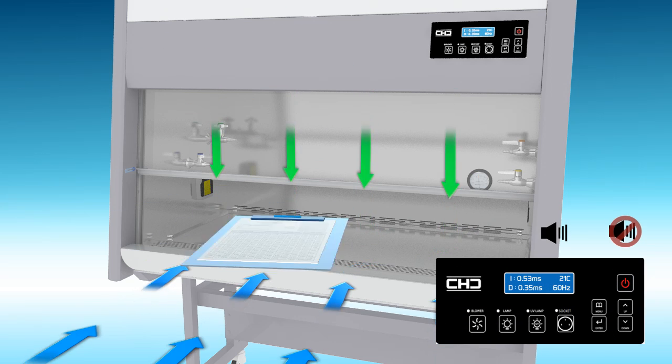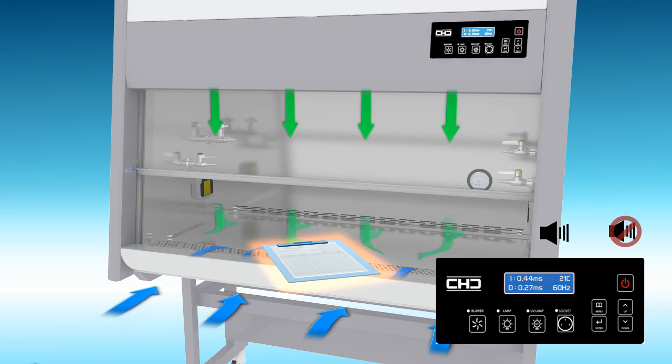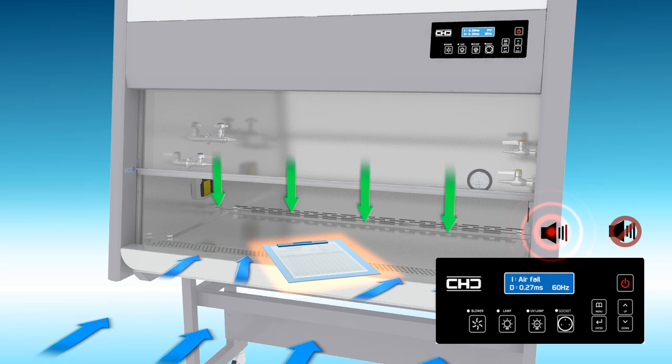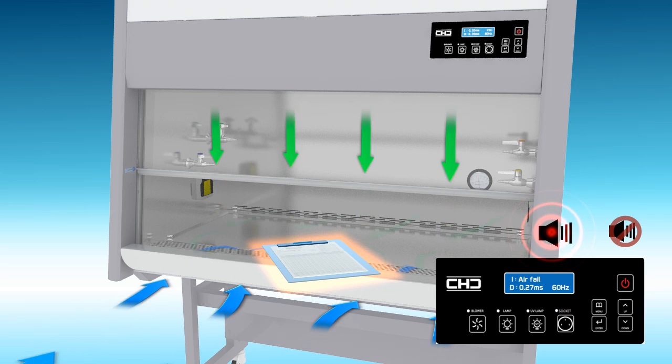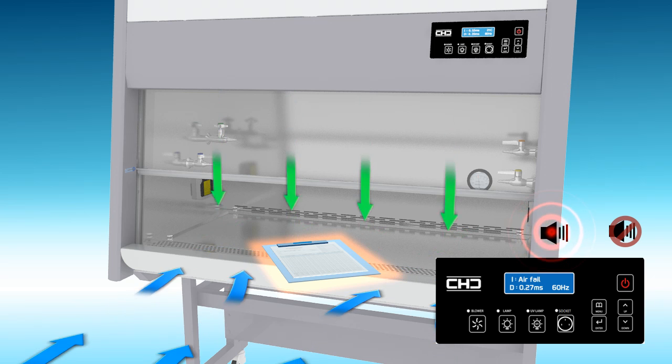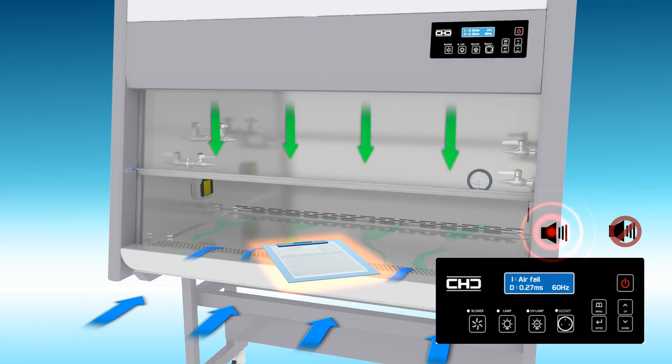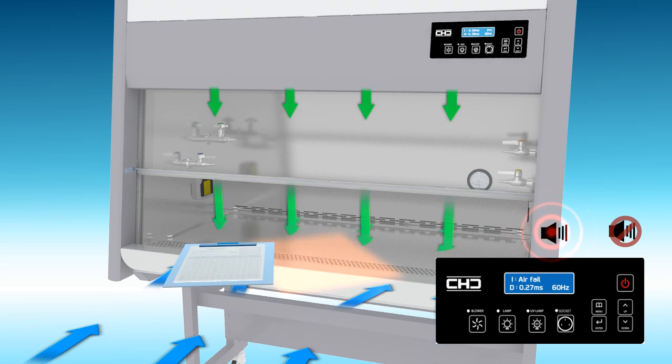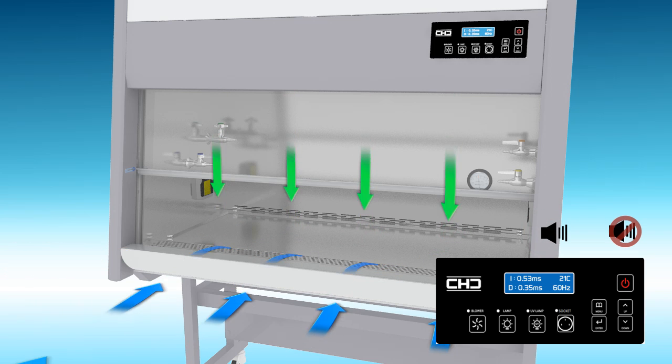Air velocity sensor is located inside the exhaust damper of the cabinet. And when the measured value of air velocity is under or over the standard, a message with an alarm will be displayed on this monitor screen. This function will help the researcher to quickly know about the abnormal status of the cabinet.